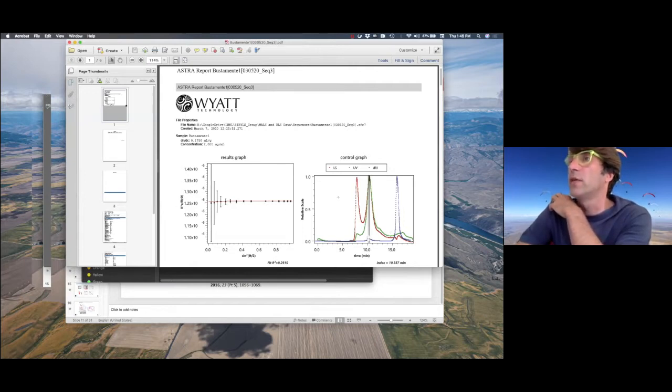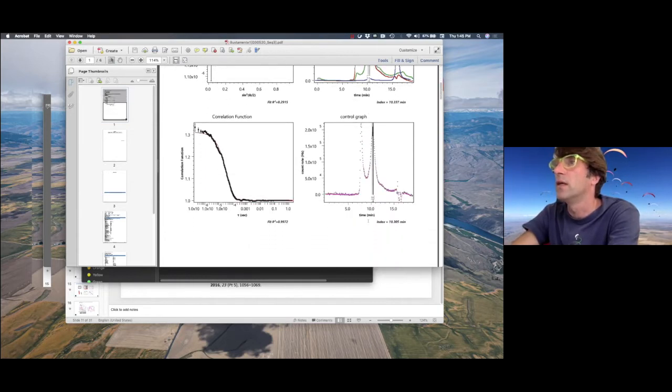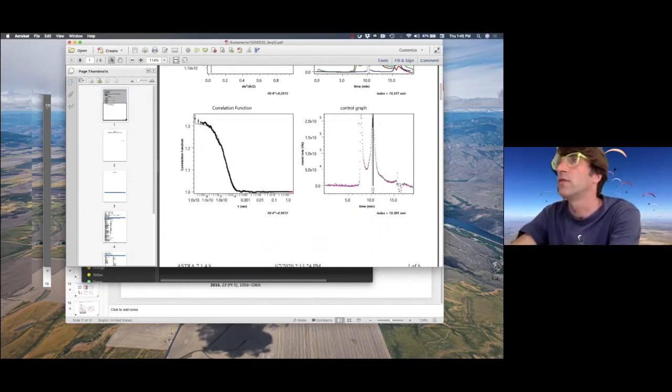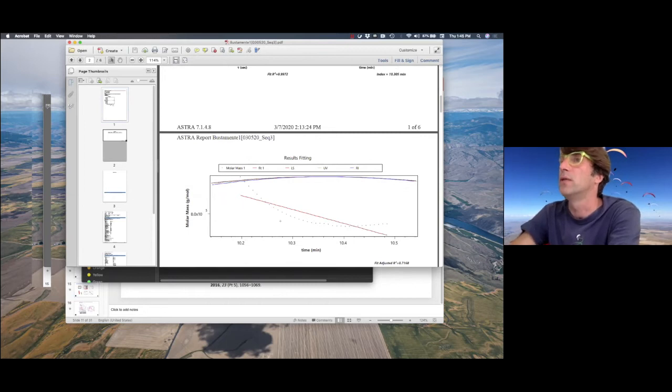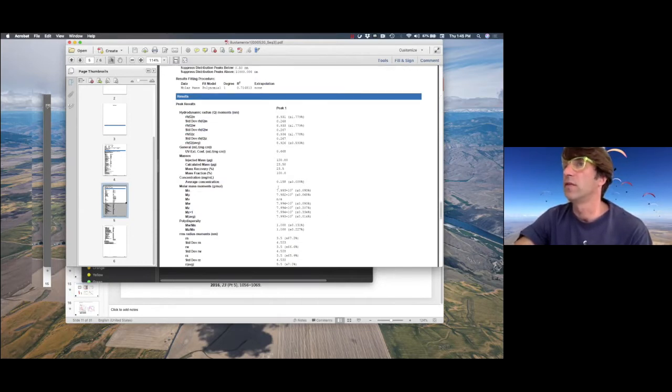So that's already information on how the size exclusion UV signal, the light scattering signal, and the refractive index look. Obviously, this aggregation in the void is not of interest, but this is probably the peak of interest, and we calculate the molecular weight. So first, before you do any further processing of the data you get, look at this PDF file, and check whether the molecular weight estimated from the peak is what you expect. All the other statistics below show about an 80 kilodalton protein. If you expect that, you're on the good side.